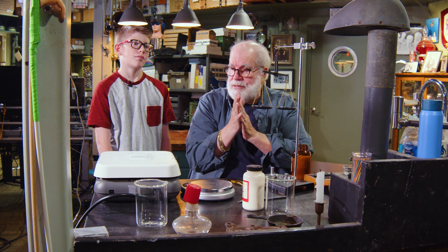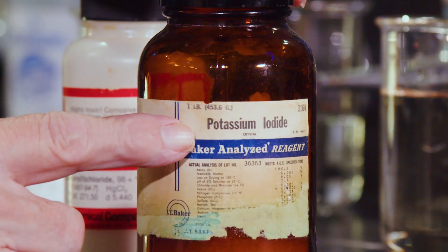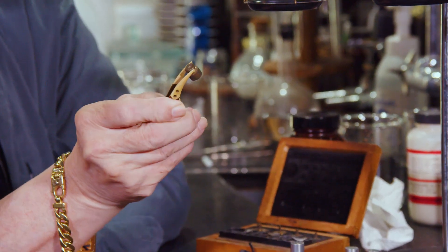I wanted to do a chemical reaction, so I was trying to think of a red thing. So what does this say right here? Potassium iodide. And I need 8.3 grams of it — 8.5 is close enough. So I got out my scales to measure it out. There's 5 grams.